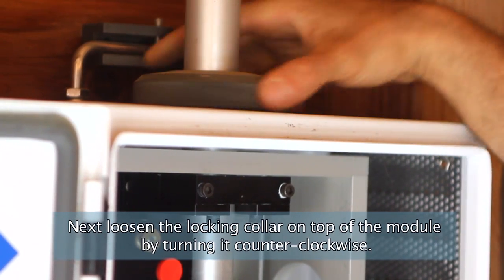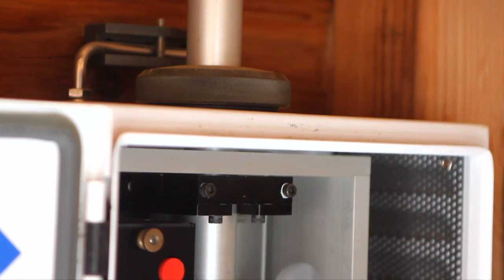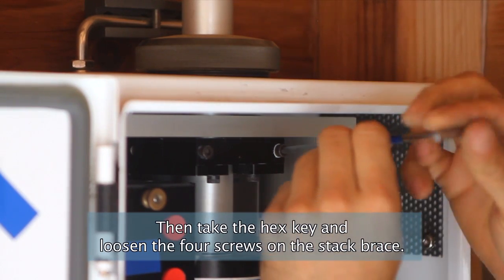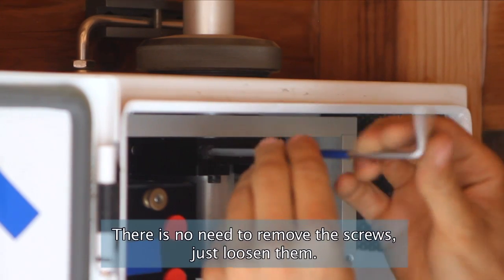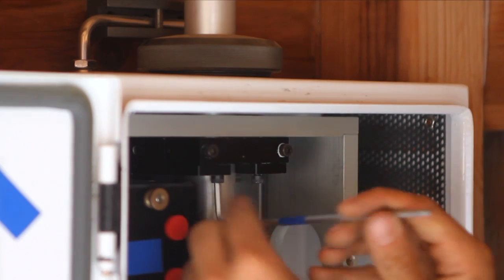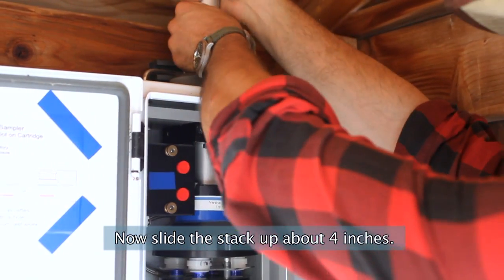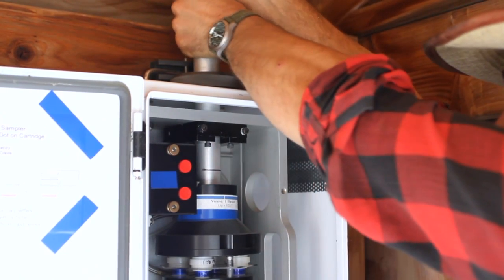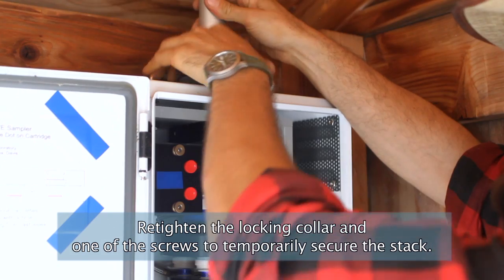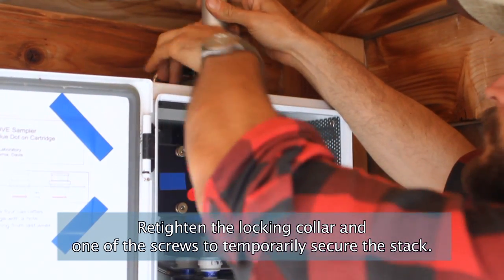Next, loosen the locking collar on top of the module by turning it counterclockwise. Then take the hex key and loosen the 4 screws on the stack brace. There is no need to remove the screws, just loosen them. Now slide the stack up about 4 inches. Retighten the locking collar and one of the screws to temporarily secure the stack.